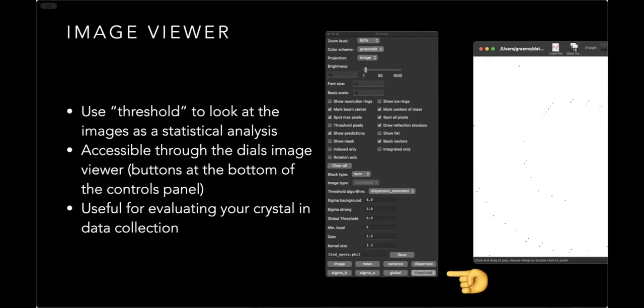It was a problem originally because with XDS, the support was not there for arcane file formats like HDF5. It was very image-based. So when the first pixel array detectors came out, people were very used to CBF files, so they made CBF files from the detectors. They then extended XDS to have this ability to use libraries to read data. And then that's what people are using now. So you've got like Durin plugins and so forth.